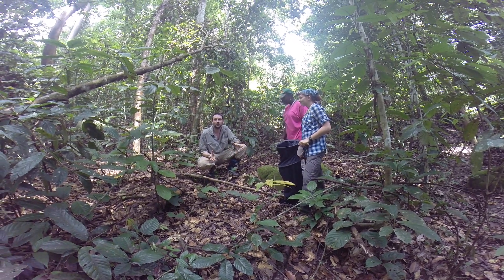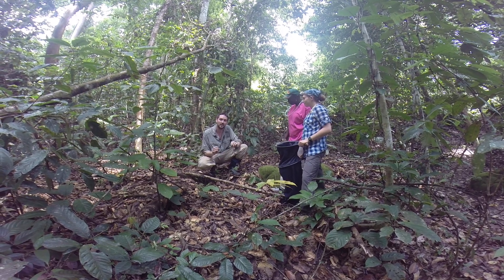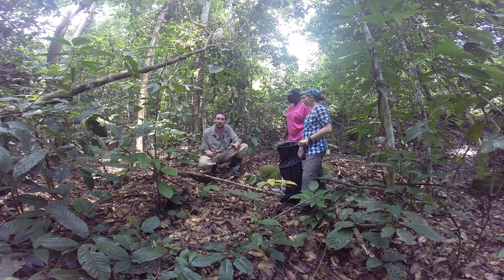Hi, so today we're going to see how to do a leaf litter extractor. A lot of ant species are actually nesting within the leaf litter, and this is one of the most diverse places to find ants.